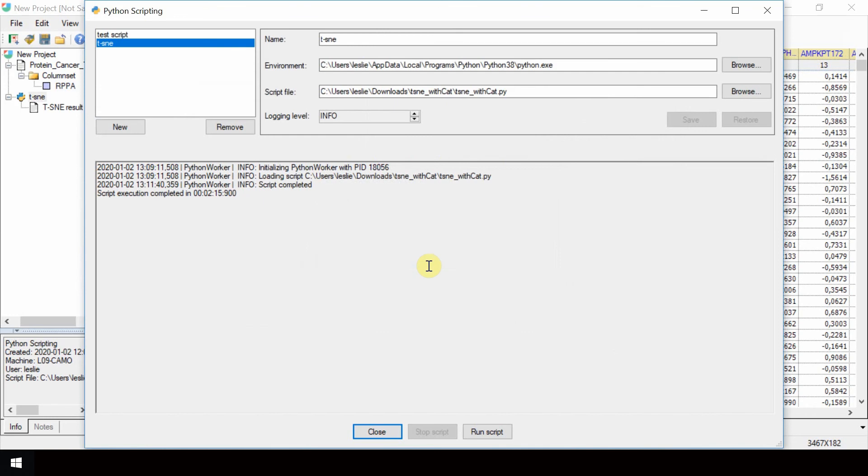Once the computations are complete, a new node will appear in the Unscrambler project navigator containing the results. Close the Python scripting window.